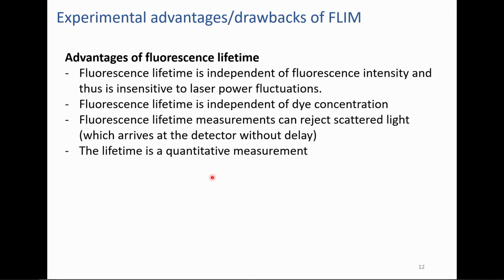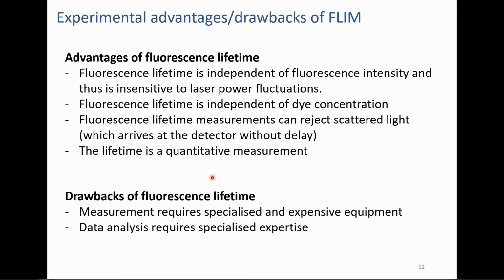It's quantitative. So it's easier to interpret than, for example, the fluorescent signal itself, where you need to know a lot about the system itself to get the signal calibrated. So the lifetime itself is an absolute quantity.